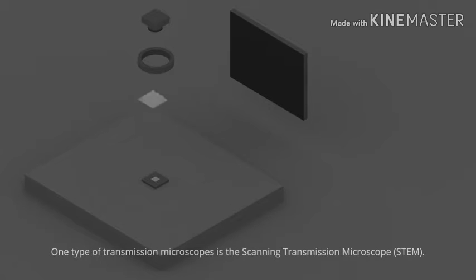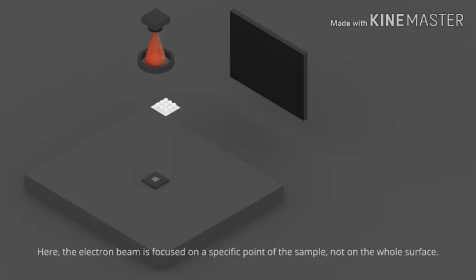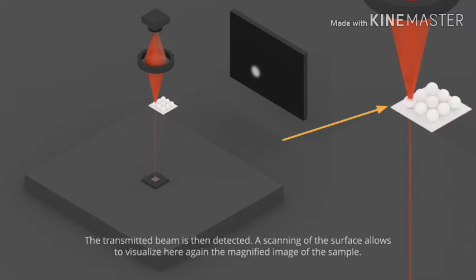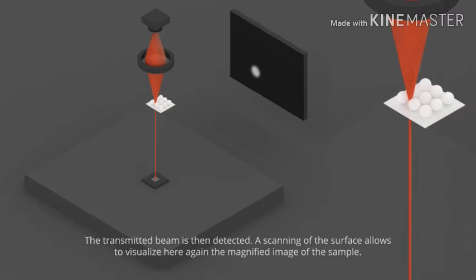One type of transmission microscope is the scanning transmission microscope. Here, the electron beam is focused on a specific point of the sample, not on the whole surface. The transmitted beam is then detected. A scanning of the surface allows visualizing and then magnifying the image of the sample.